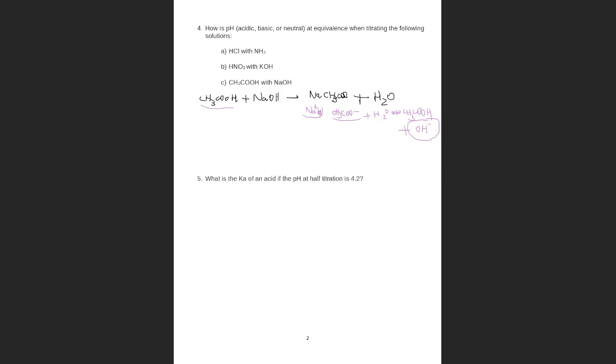So this is kind of the reason. If you want to remember, just remember that when a weak acid is titrated with a strong base, the equivalence point is at a basic pH. Why? Because the conjugate base, which is this one, of a weak acid has basic character. What does it mean, basic character? That it will release OH, in this case, that is basic. Any questions on this explanation? Okay, so then we'll go to the next one, and this is easy.